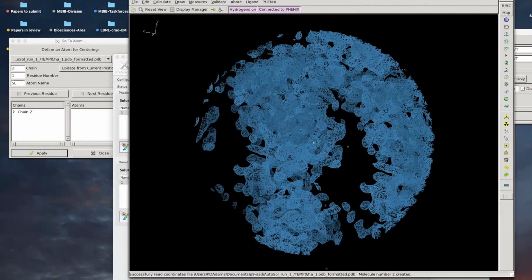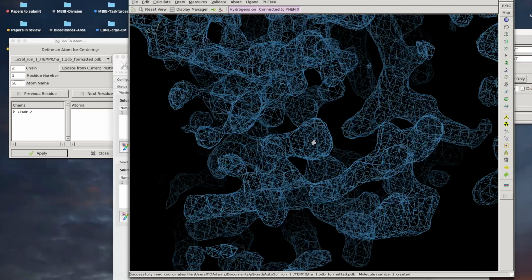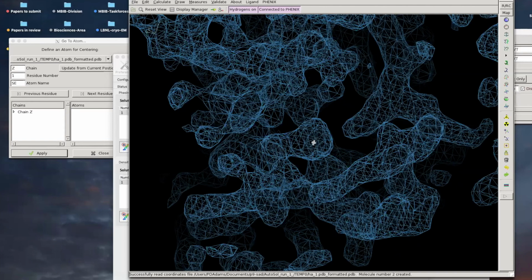Now the fact that it's flat here is not new information, right? We told it to make it flat. So that isn't telling us anything, but the protein is now much sharper. If we zoom in on that location where that atom was, and we just blow it up, we should see density that looks a lot more like protein. And of course, we didn't use that information. So that's new, independent, unbiased information about what this map really should look like. So now we have a very nice electron density map, and this came mostly from the fact that we knew that the solvent was very flat.